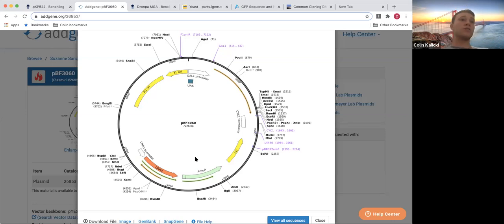Now, certain species, hint yeast, already have some of that resistance baked into them. So it's not a good selection marker. So smarter people than I have found a better way and devised a good way in order to select for these things. And one of the ways they do it is through, I always mess this up, it's like autotrophosity or something like that.